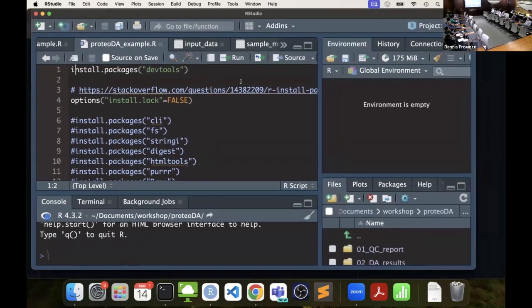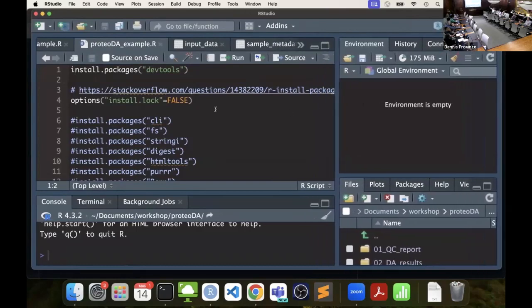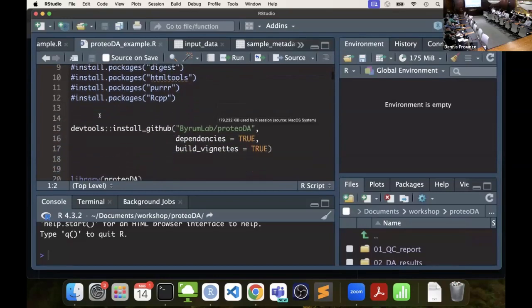I don't know why this is so important to me, but I've gone through this before, and I just want you to know that what she's doing, everywhere that there's a line that starts with a command in white, she's hitting Control and Enter, and then it runs that. Yes.